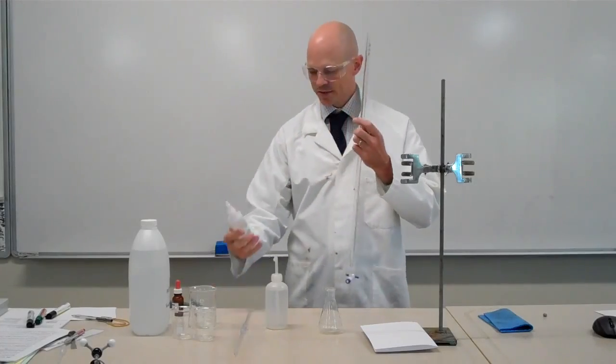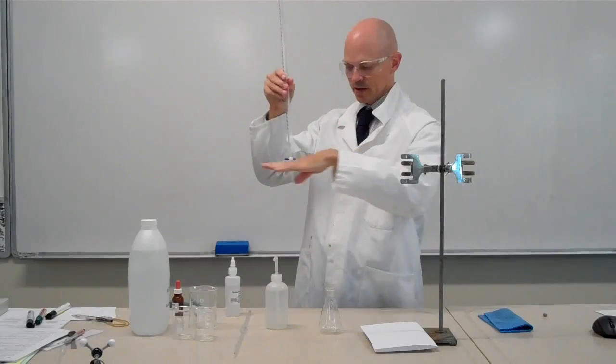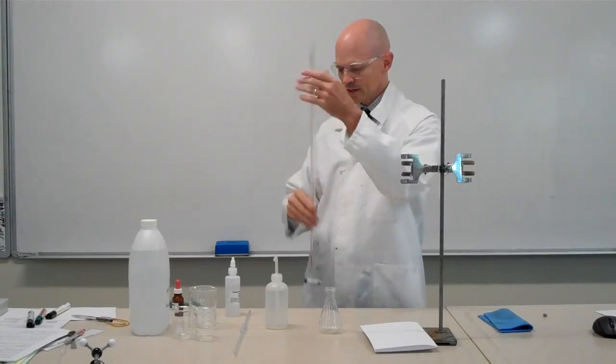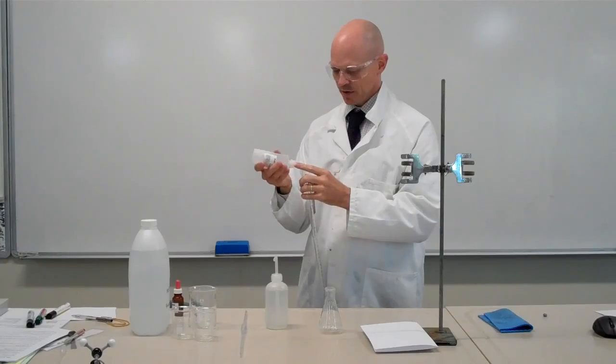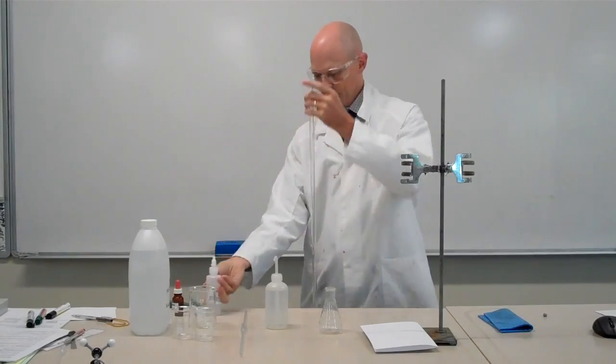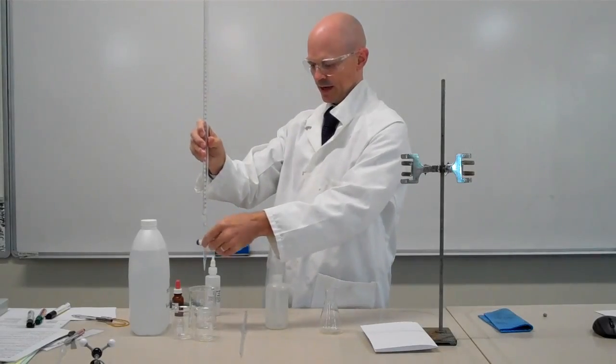The first thing we need to do is wash out our burette. The tap needs to be closed, which means it's going to cross the flow of the fluid through the burette. So I'm just going to add a little bit of sodium hydroxide to my burette and just open the tap, let it drain out.